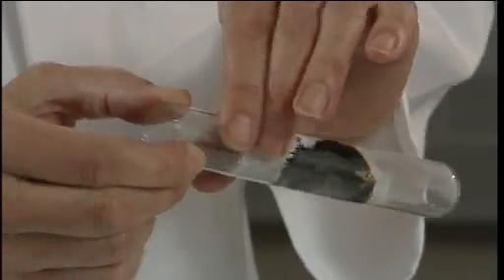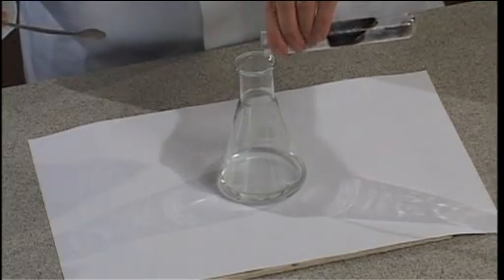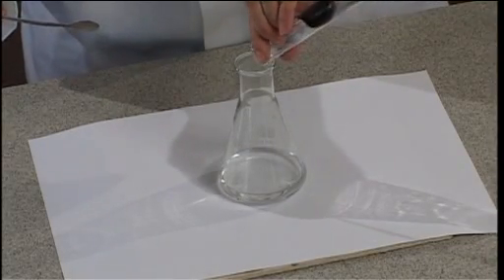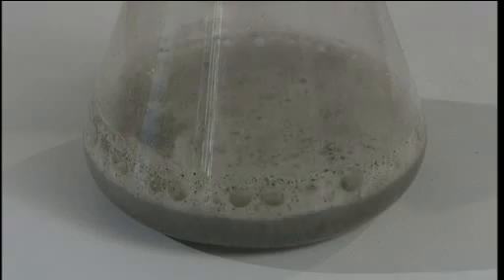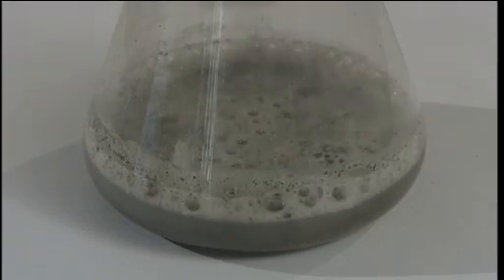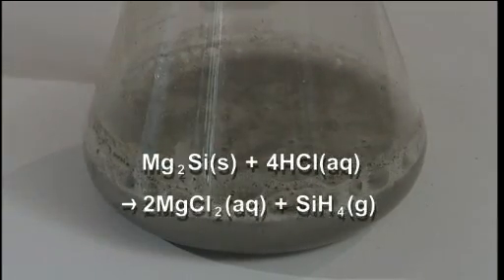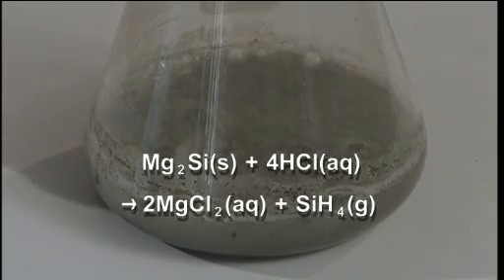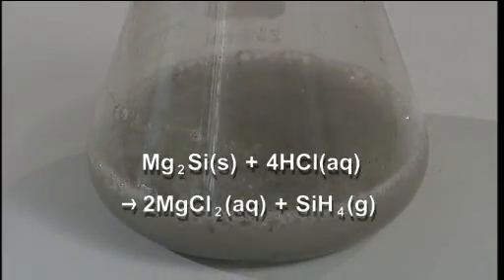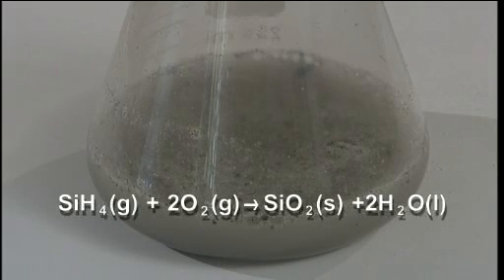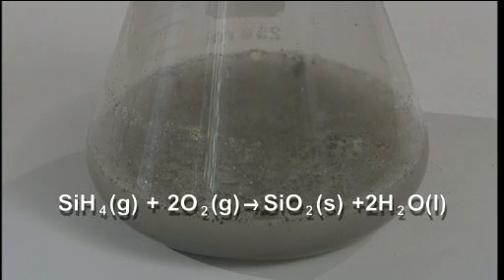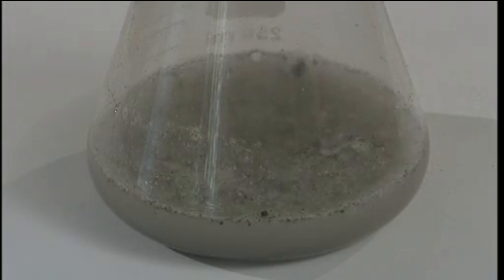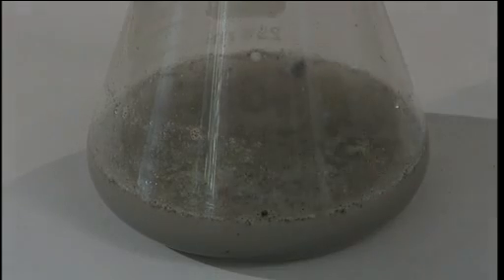Pour the contents of the tube into a beaker of two molar hydrochloric acid. You'll also notice small pops, these are often accompanied by yellow flames. These pops are caused by magnesium silicide reacting to form silanes. Silanes are hydrides of silicon analogous to alkanes. Silanes, unlike alkanes, ignite spontaneously in air due mainly to the weakness of the silicon-silicon and silicon-hydrogen bonds compared with their carbon analogues. This is a point that could be discussed with post-16 students.